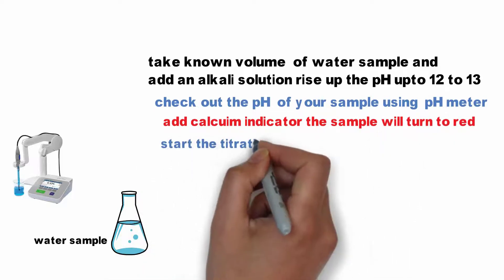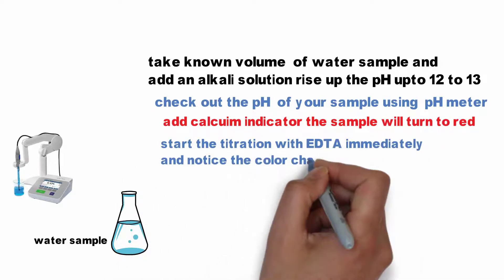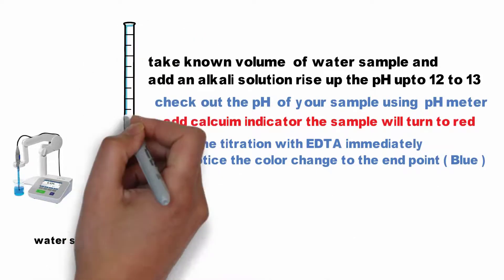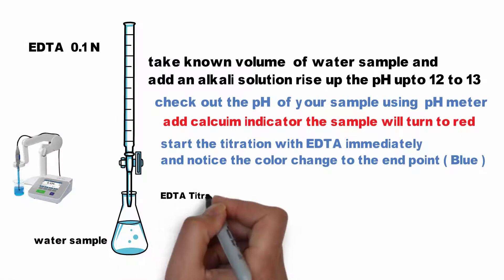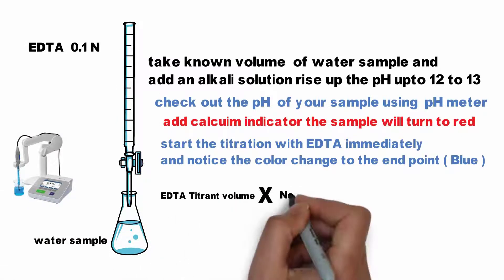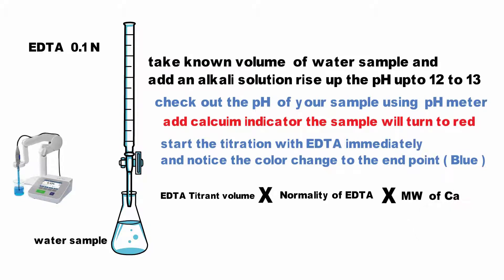The sample will turn red. Start the titration with the EDTA immediately and notice the color change to the endpoint, which is blue. Calcium hardness equals EDTA titrant volume times the normality of EDTA times the molecular weight of calcium divided by the sample volume.